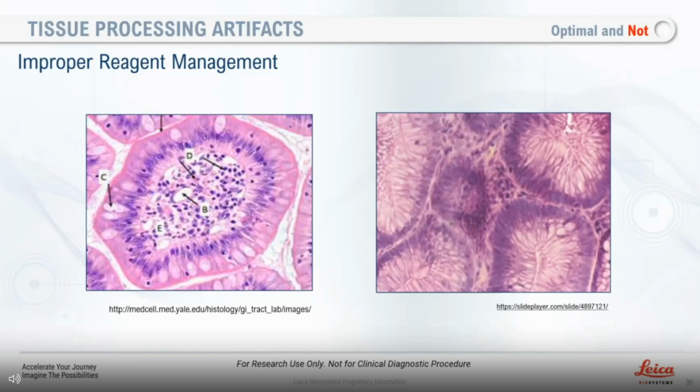Again, yeah, any organ that's considered large, I have to try to give some type of reference. So, if you're going to do tissue processing on mouse or rat brain, you're probably going to use maybe a perfusion technique. I don't know. I don't originally come from the life science background. My experience is only in clinical. But I've been with Leica for 12 years, so I've learned a lot in the life science arena.